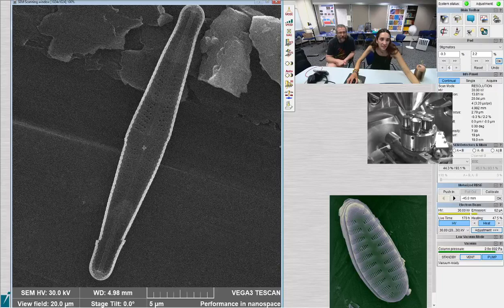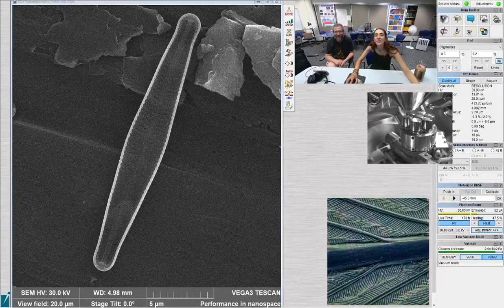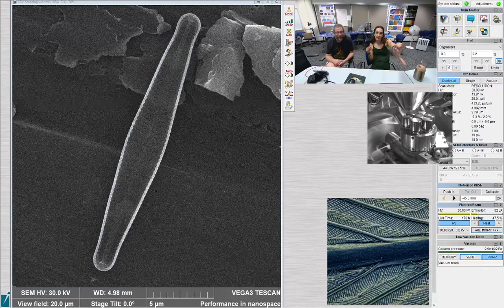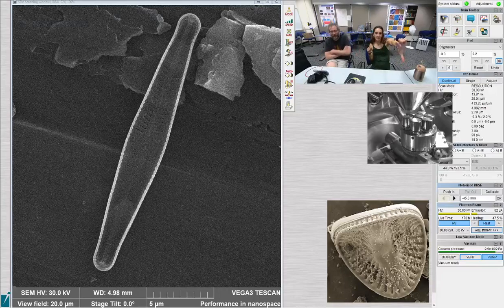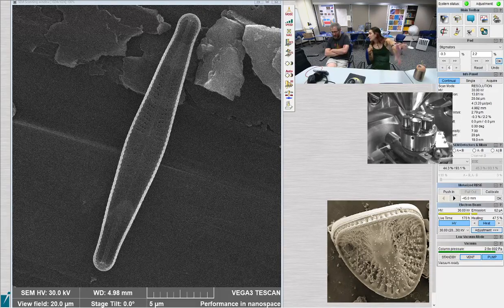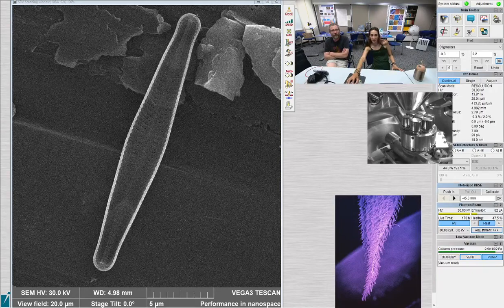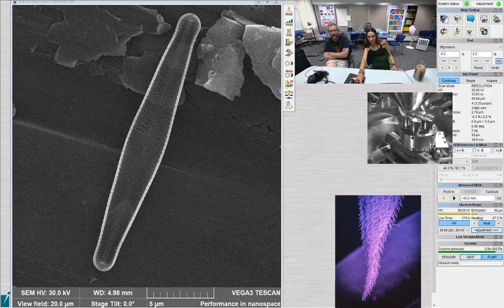Can you turn it just a little? So we need to turn it clockwise. This way? Or that way. Either way, just so that it's corner to corner, to maximize the image. It's like 10 degrees or something? Oh, probably it's like 20, 25, something like that. Try just changing it to 25 and see what happens.